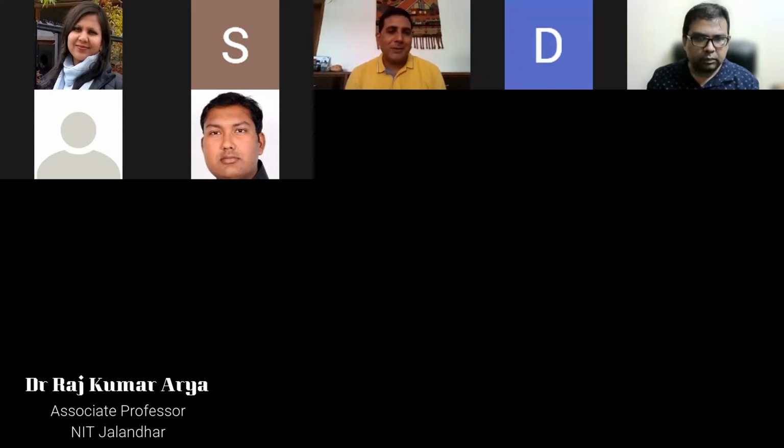So we will start our talk with DSC analysis. If the organizer permits, let me give the demonstration first, followed by theoretical explanation. Otherwise, I will go with explanation first and then the demonstration later. What do you suggest? Sir, as you feel convenient, it's all right. Okay, so it's actually afternoon, many of us are tired, had lunch, so I don't want to make them sleepy. So let's have the visual demonstration part first, and then I will explain the theoretical concept behind that.